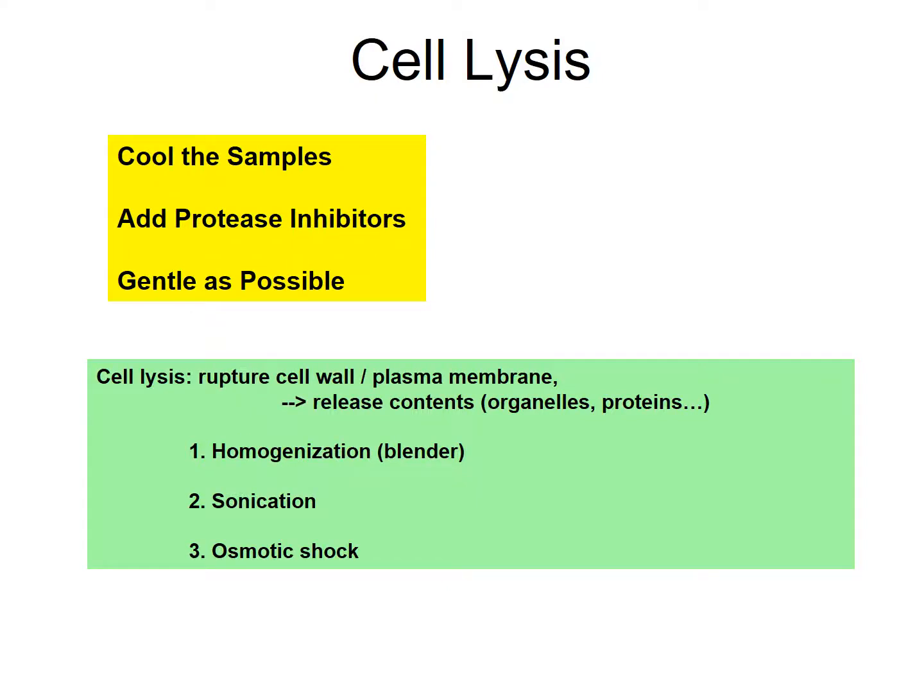We are just getting into centrifugation and organelle and protein fractionation. So we're moving down, top down, from organs to primary and secondary cultures, the cell line concept.